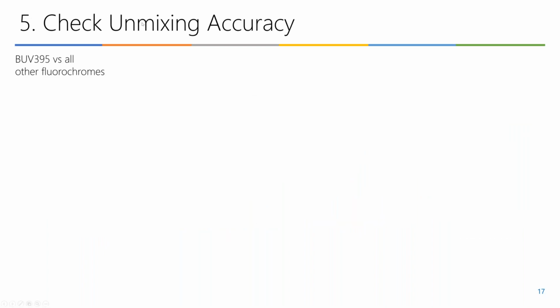Step number 5, check your unmixing accuracy. So during unmixing, what we do is we decompose the multicolor sample into multiple dyes relative to the reference controls. And an important step in quality control is to identify if there are any errors or issues with your unmixing.